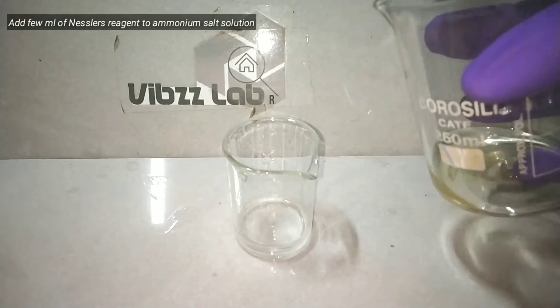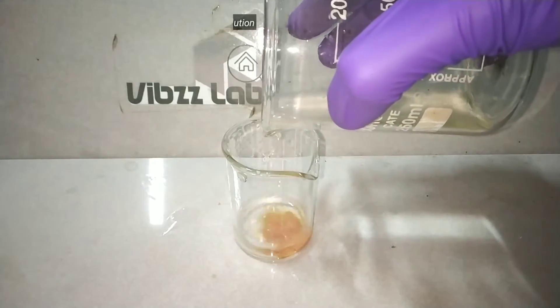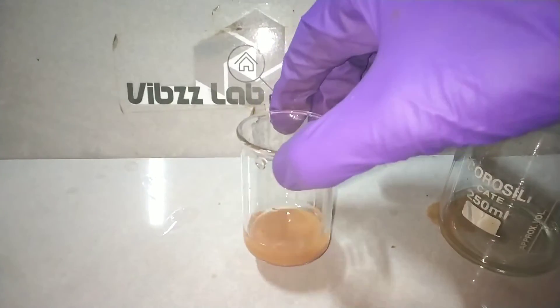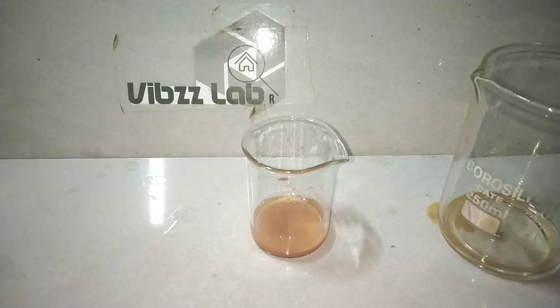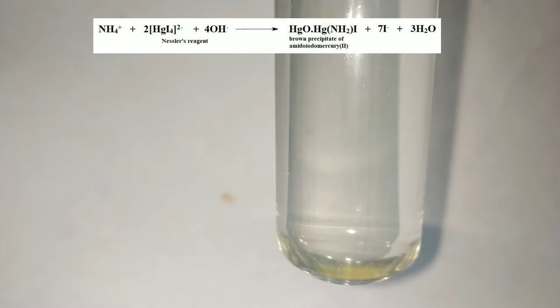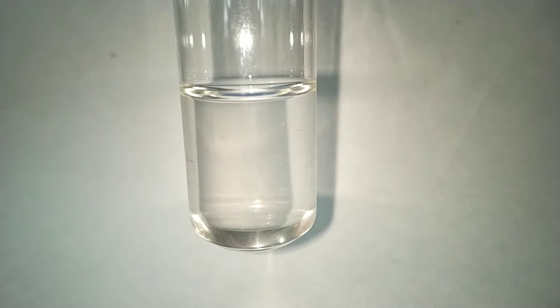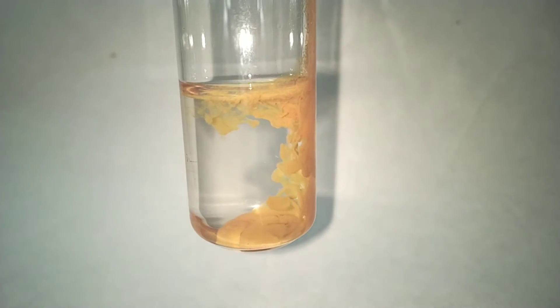Now let us test it. In the beaker I have some ammonium salt solution. I then add the Nessler's reagent into it. Immediately you see a brown colored precipitate being formed. What is happening here is that the tetraiodomercurate(II) ion in the presence of base reacts with the ammonium ion to form the iodide of Millon's base, which is the brown colored complex precipitate. This is the confirmatory test for ammonium ions.